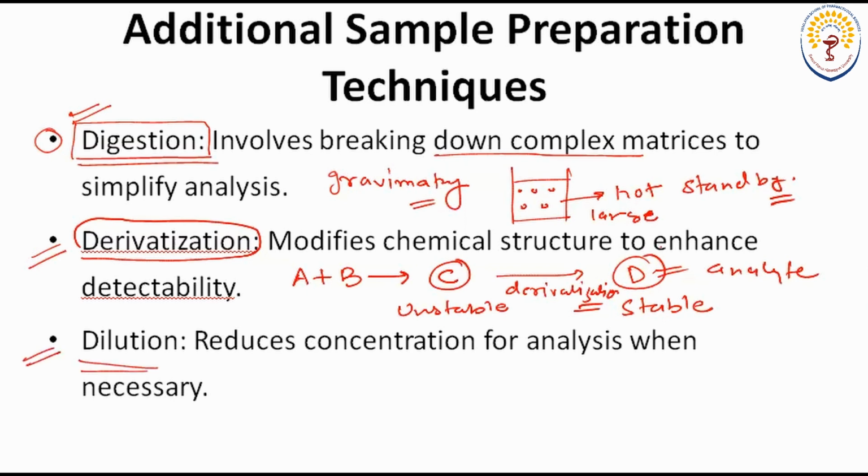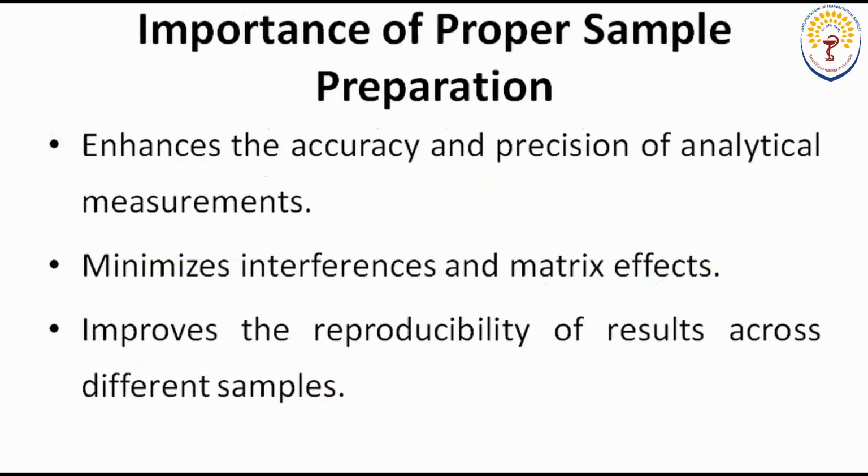Now coming to dilution. Most of the time we also use dilution. Dilution simply reduces the concentration for analysis. Dilution means you are increasing the amount of solvent in comparison to the solute. So these are also required in some different kinds of analysis.